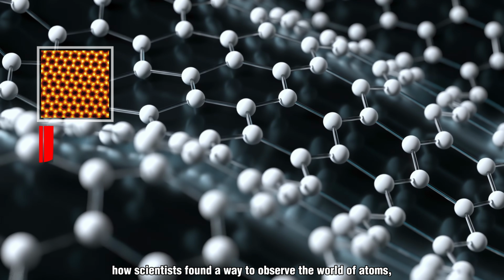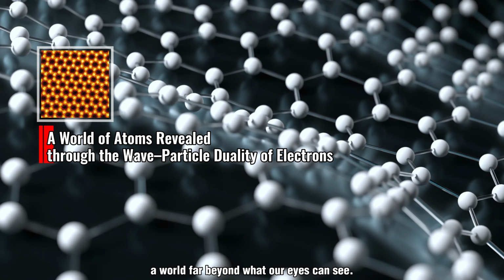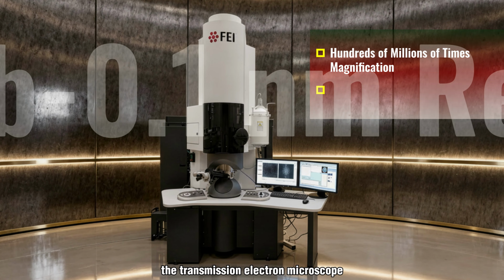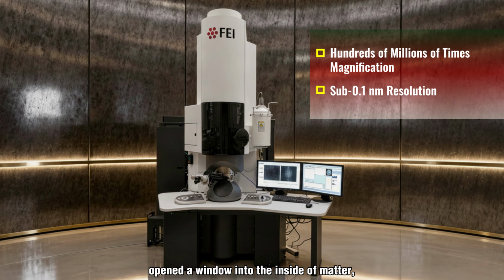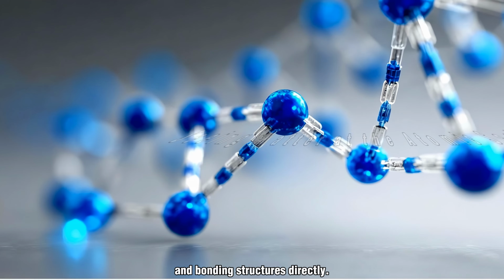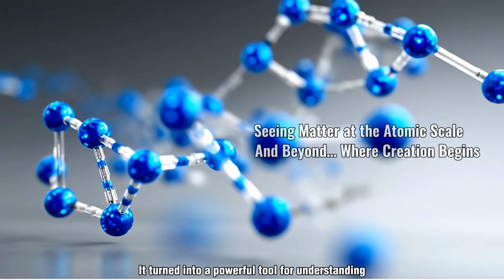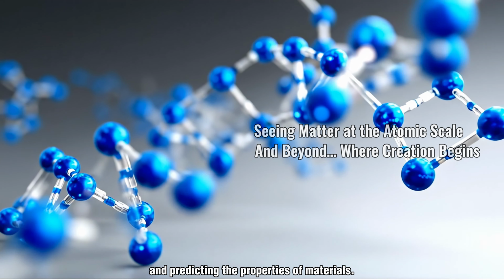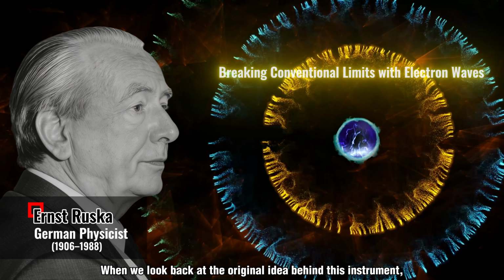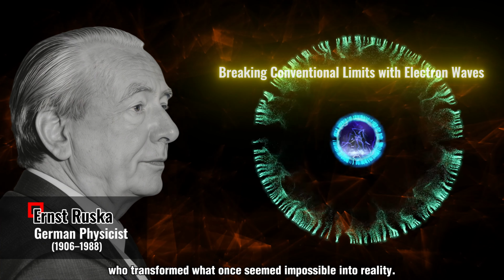Today, we explored how scientists found a way to observe the world of atoms, a world far beyond what our eyes can see. By going beyond the limits of light and using the wave nature of electrons, the transmission electron microscope opened a window into the inside of matter, allowing us to examine atomic arrangements and bonding structures directly. This technology became much more than a microscope for seeing smaller things. It turned into a powerful tool for understanding and predicting the properties of materials. When we look back at the original idea behind this instrument, it's hard not to admire the insight of the scientists who transformed what once seemed impossible into reality.